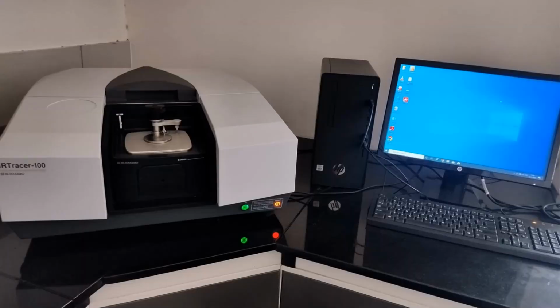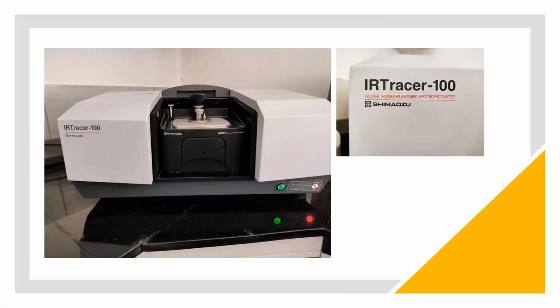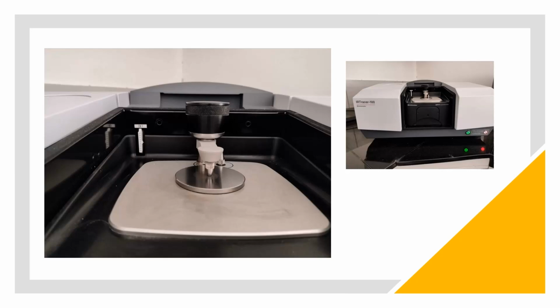As you look in the picture, this is an FTIR setup. This model is the IR Tracer 100 spectrophotometer. It offers high sensitivity. In this figure, you see the QATR10. It is a single reflection ATR accessory with a diamond crystal, designed especially for the IR Tracer 100.